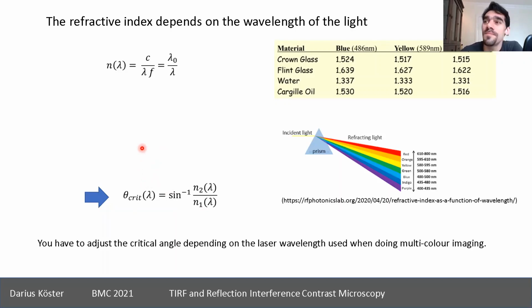Okay. So now we get total reflection. But why would we expect to see anything excited above that reflection? If the light gets reflected, why should it excite anything inside, on top of that glass slide where the light gets reflected?